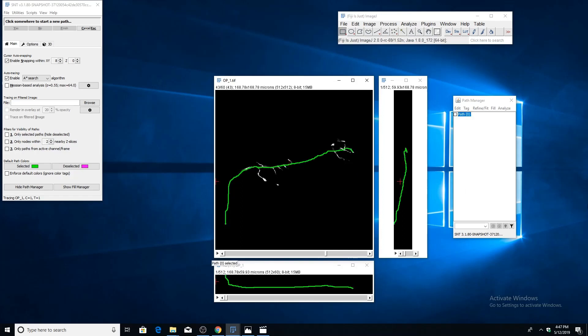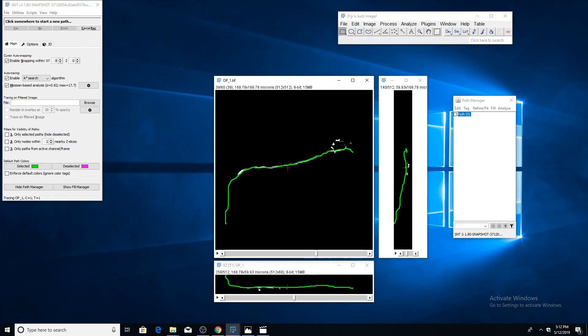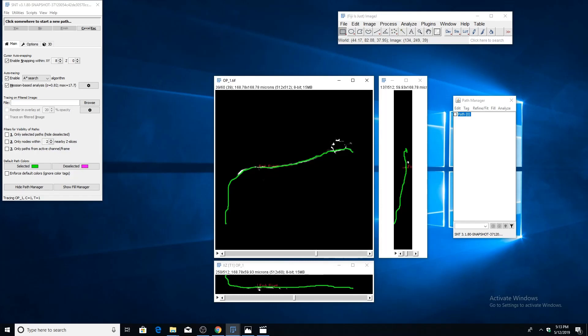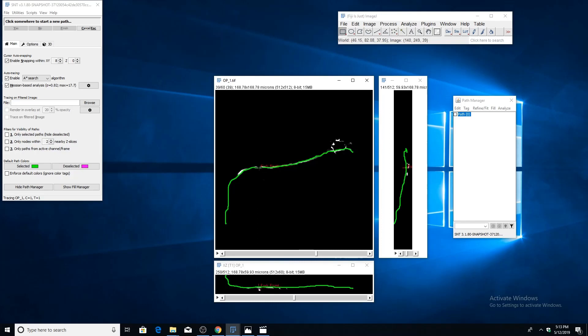Now that we've finished our primary path, we can go ahead and create a branch point. In order to create a branch, make sure the path that you want to branch off of is selected. Then just hold down the alt and shift keys at the same time. If you move your cursor along the path, you'll see that it snaps to the nearest node on the path and will let you create a fork point there. Find where you want to create your branch point and click. You'll see, like before, the blue node has been created.